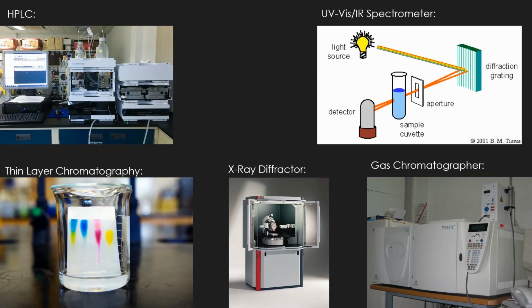Another alternative that is quite like HPLC is gas chromatography, which is typically used instead of HPLC for the analysis of more volatile compounds like fragrances and large hydrocarbons. However, they can analyze very similar compounds and can usually be used interchangeably.